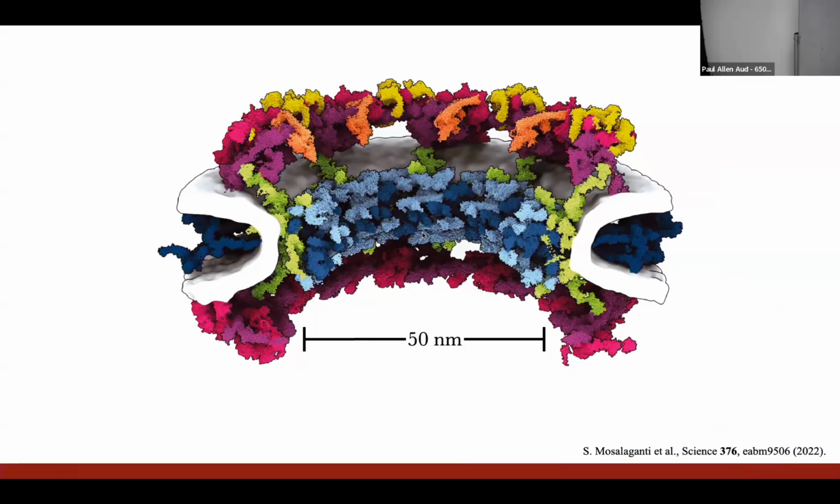And so what we actually have to do is freeze the sample to lock those nuclei in place. And this allows us to get just enough signal to noise that I can orient many copies of that molecule in space and then average the heck out of it. So for an image like this, the poor PhD students had to collect 617 what are called tilt series. This is you expose your sample to a range of electron incident angles, right? They looked at over 10,000 individual what are called single particles, and then you plug it into an extensive data analysis and machine learning pipeline.